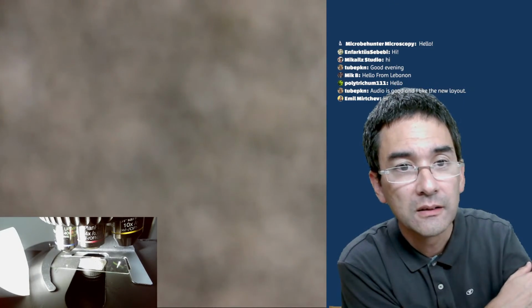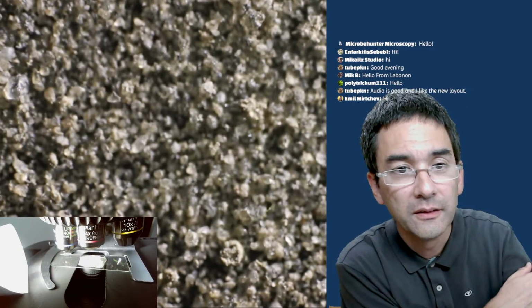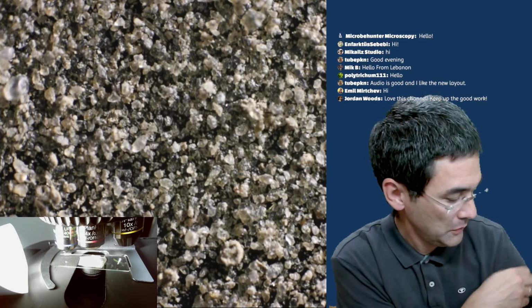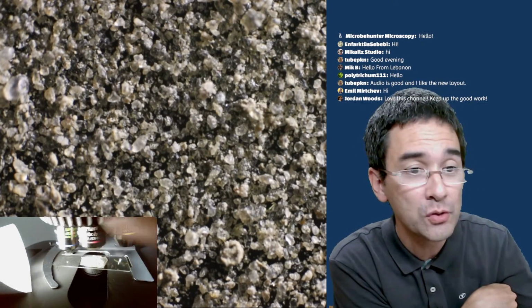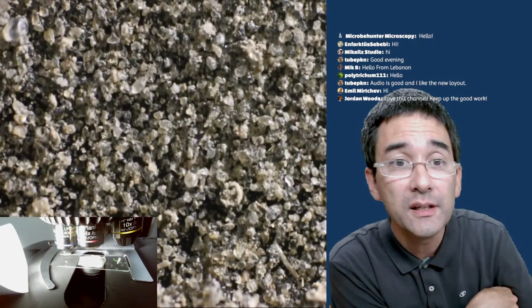Okay. And see, here we go. Okay. It looks almost like it's in a stereo microscope. Of course, you do not get a three-dimensional view, but this is now using the low power 4x objective. And you see that it looks quite nice, like under a stereo microscope.